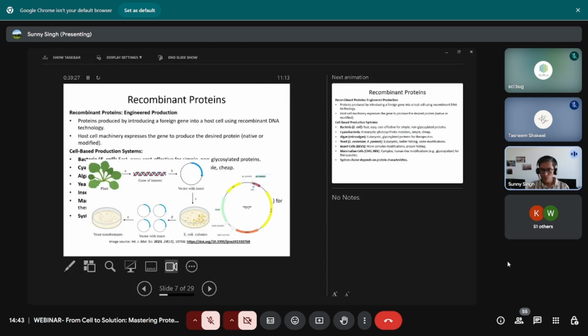And then, just to give you an example here, I wanted to show how some scientists, I have given the source below, scientists in Russia, are using plant membrane proteins. They are removing the membrane of the leaf, getting the DNA out, and the gene of interest is being isolated. So your DNA source is from the plant, and that is then put into a vector, a plasmid vector, a cloning vector, and then you transform it into E. coli and you plate it.